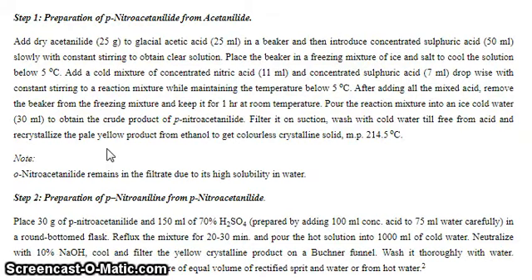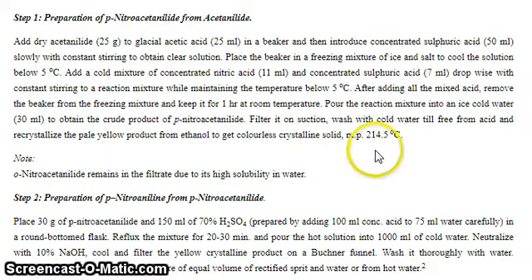After adding all the mixed acid, remove the beaker from the freezing mixture and keep it for one hour at room temperature. Pour the reaction mixture into ice cold water to obtain the crude product of paranitroacetanilide. Filter it under suction and wash with cold water until free from acid.